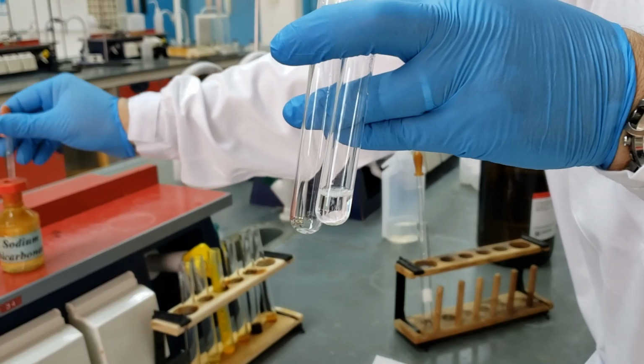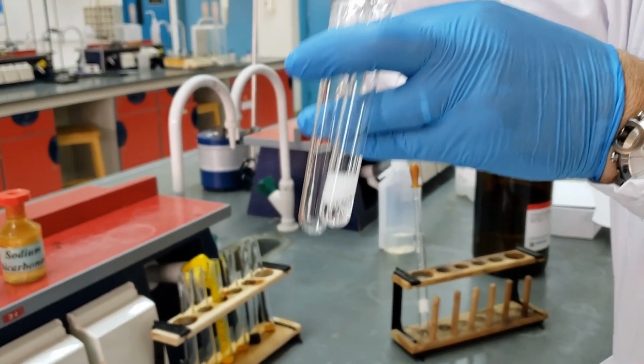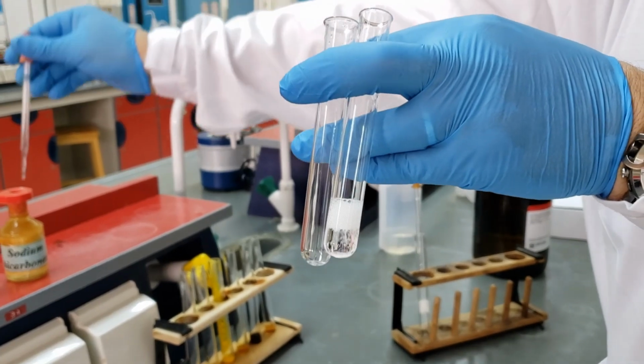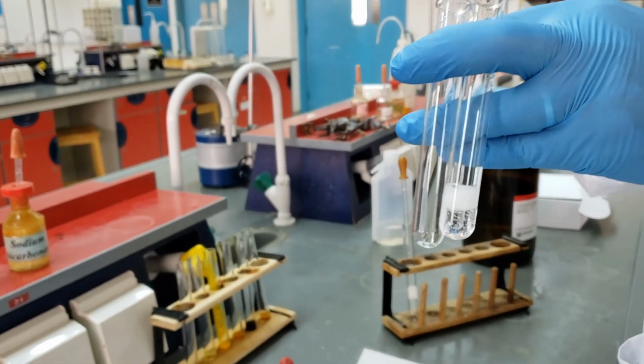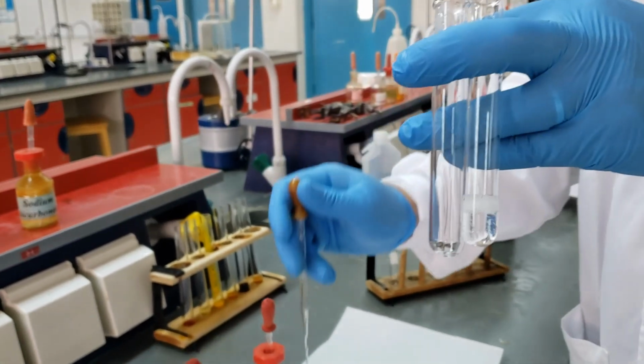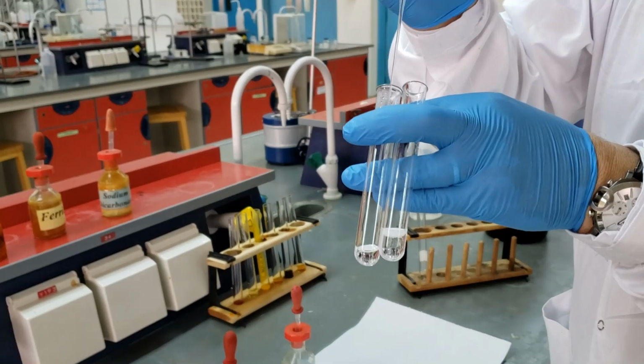I'm just going to repeat it again, please. Check carefully what's going to happen. See, evolution of a gas is a positive sign for the presence of carboxylic acid functionality. Now we do the same test for my unknown compound and check here what's going to happen.